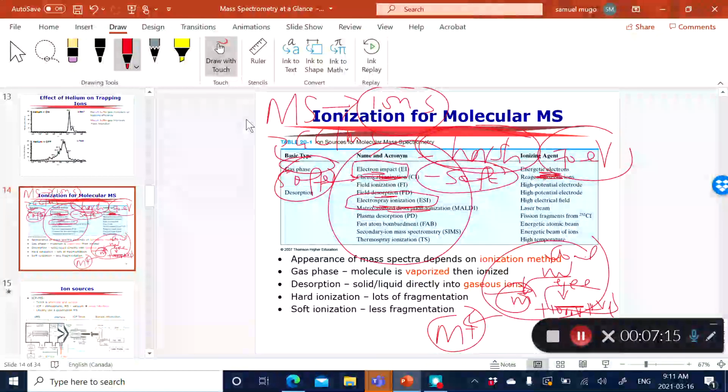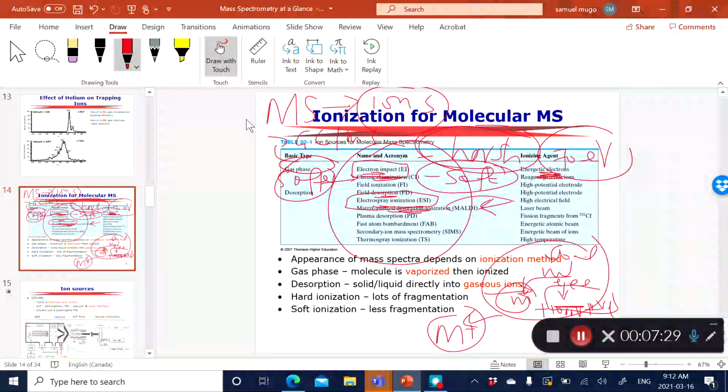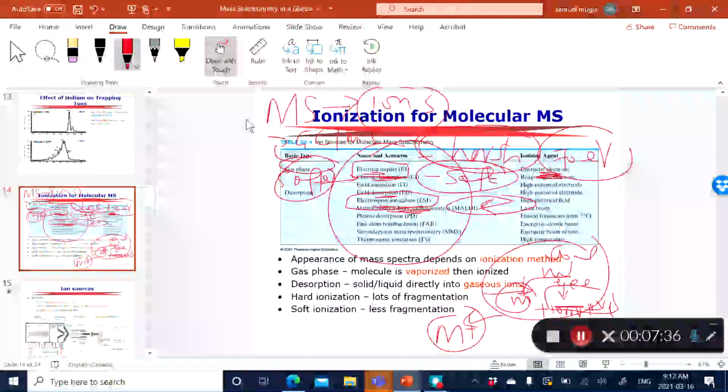You're also gonna see the MALDI, matrix assisted laser desorption ionization. Again, it's a very soft ionization method, maybe not as soft as ESI, but relatively soft. In fact, if I may mention, that's what I did for my PhD. My focus was actually mass spectroscopy, the MALDI specifically.